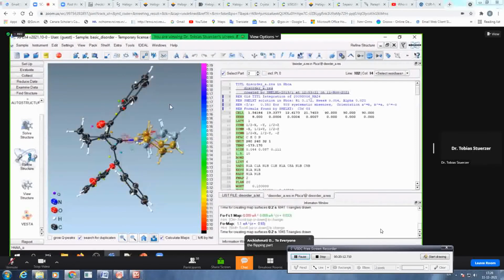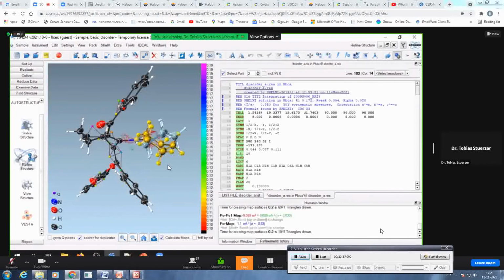So that was the starting point. That's our molecule. This here is the part highlighting, which highlights the different parts. There's this very nice checkbox up here, select parts. I used ShelX for many, many years, and I missed it for many, many years. Christian showed me at some point. If you click that, it allows you to select parts. So now at the moment, only part 2 is selected. And if you say now include part 0, it will now select part 2 and part 0, or here now part 1 and part 0.